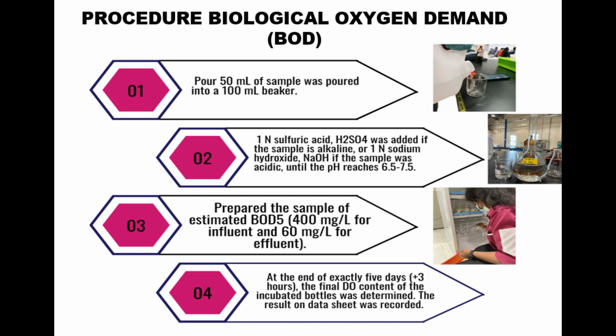For BOD measurement, 6 units of 300 ml BOD bottles were labeled separately. Next, the bottles were filled completely with dilution water. So the remaining bottles were placed in the incubator at 20 degrees Celsius and incubated for 5 days.